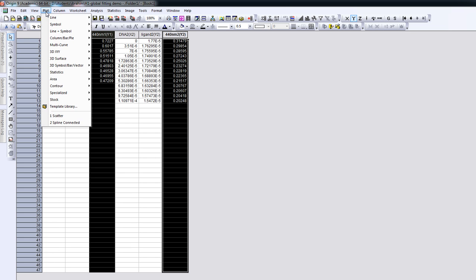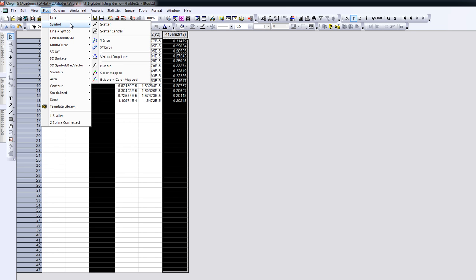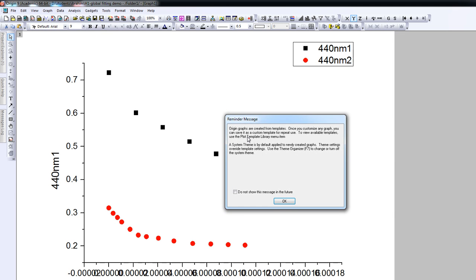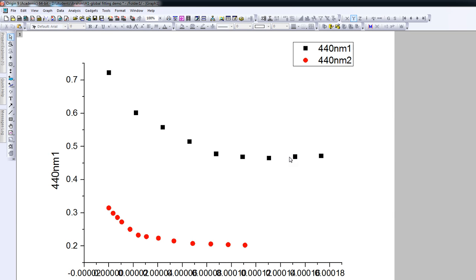So we go to the plot. We want a scatter plot, so we press scatter. And what we get, apart from this message, is the plot of the absorbance at 440 nanometers as a function of DNA concentration. We'll edit the axes later so that they actually show what we want them to show.